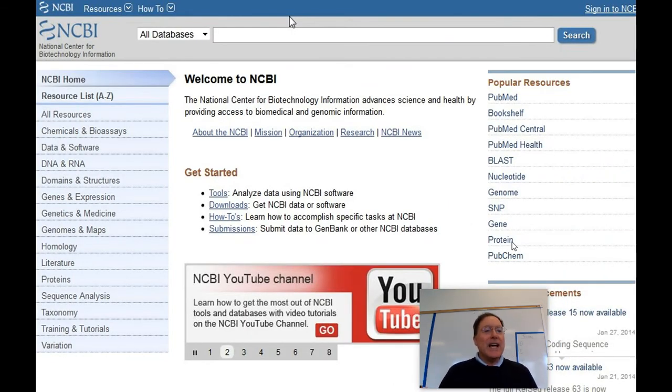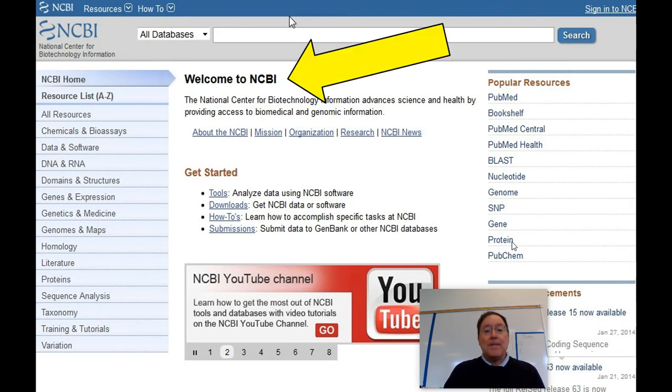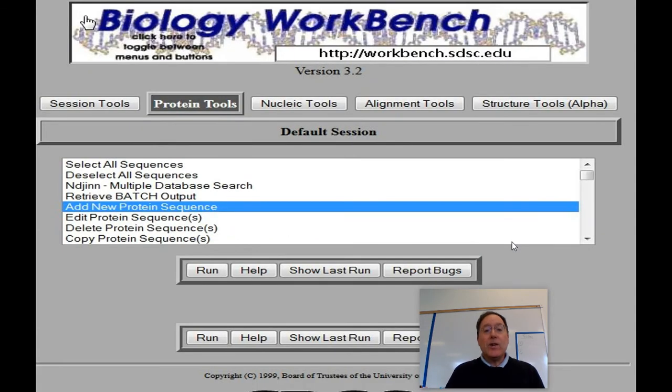So anyway, pull back the curtain a little bit. Here's the National Center for Biotechnology Information. Basically, you're going to use the BLAST tool on the right-hand side. There are instructions in Mr. Anderson's video and on this piece of paper, and it will pretty much tell you what to do. Eventually, you're going to get all of these sequences and put them in here.